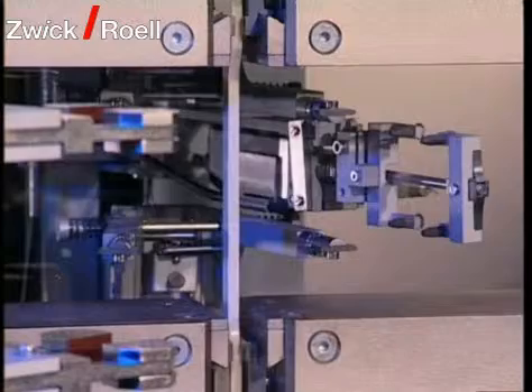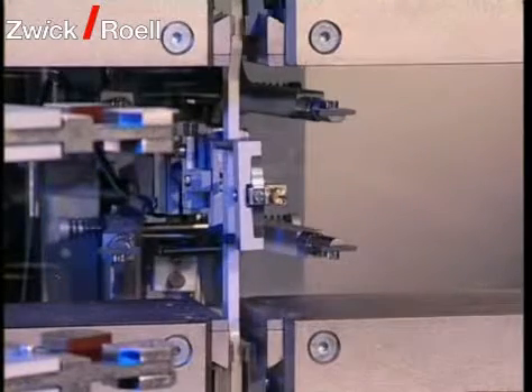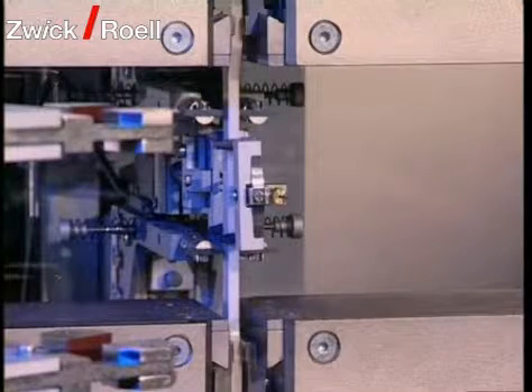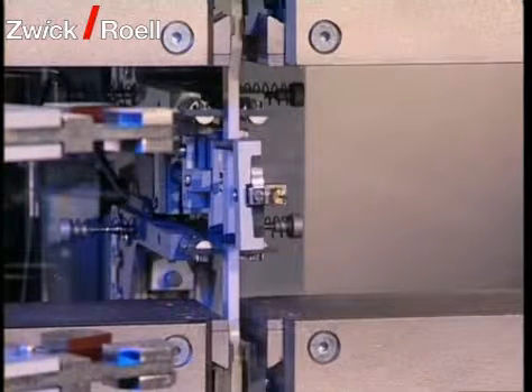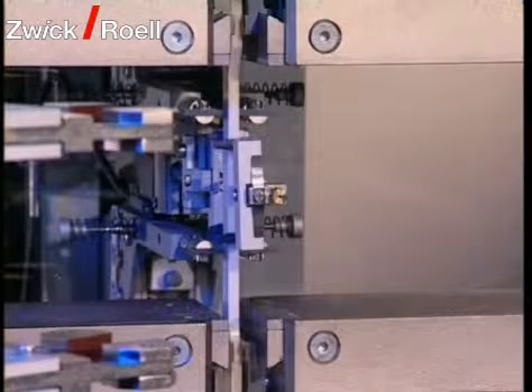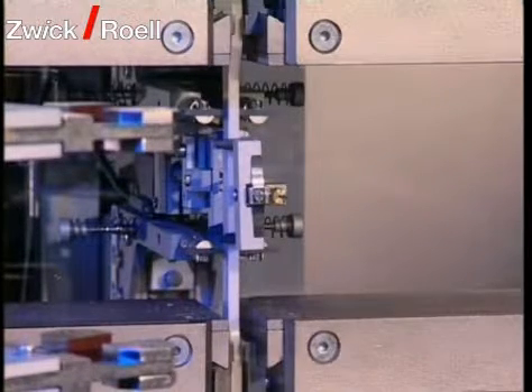A protective shield is driven in front of the test area to protect against splintering specimens. The reduction in width monitor and extensometer are automatically applied after pre-force has been reached. Various extensometers from the ITZFIC program can be used, depending on the material's characteristics and specimen extension.